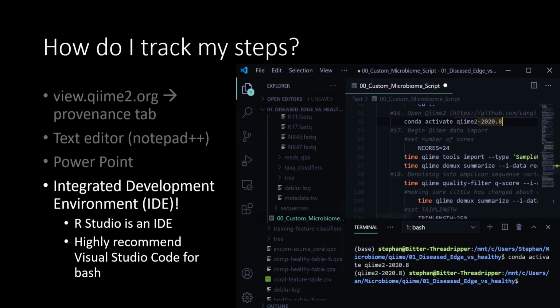One more useful thing about it is it actually tells you the files in the folder where you are. So here's some sequence files that I have, different microbiome files for different coral samples from Israel, actually. That was cool. So I'd recommend getting this, and it should work on most platforms, although I'm not exactly sure if you'd need a Windows subsystem for a Macintosh, for example.